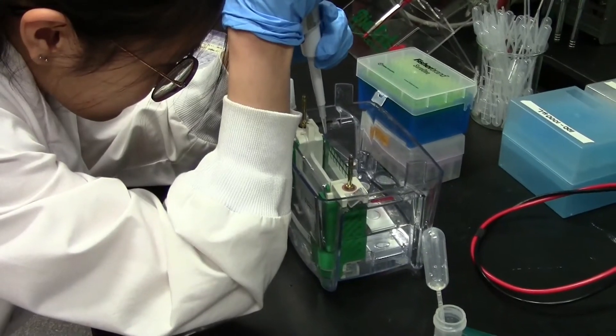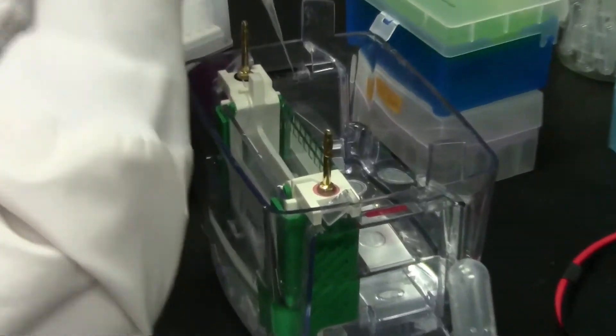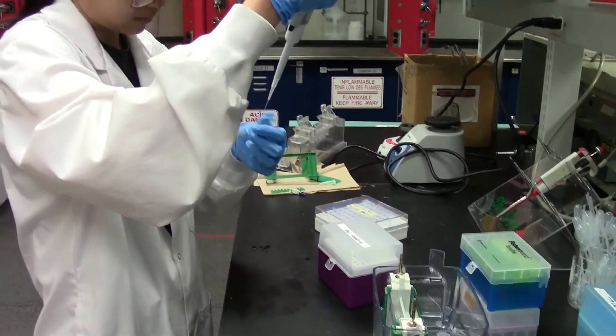Next, using a micropipette with gel loading tips, you should carefully load 5 microliters of dye containing bromophenol blue and xylene cyanol FF.